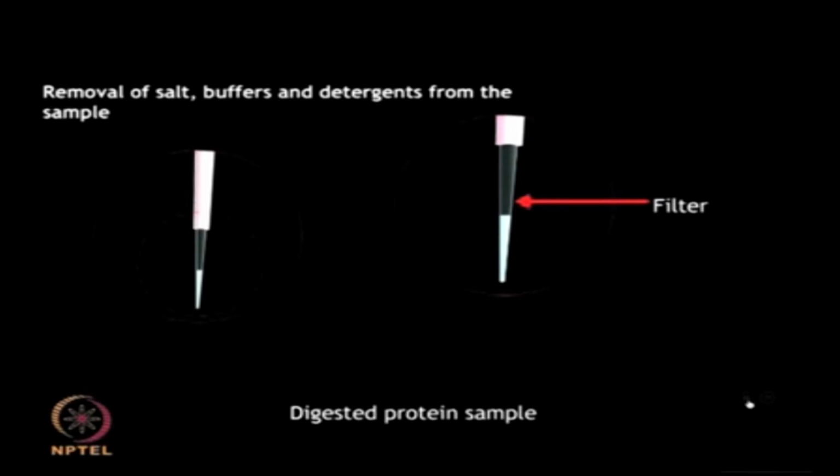It offers several advantages such as quick purification, sample enrichment, and ensures that there is no contamination. So, there are multiple advantages of using zip tips. However, it can purify only a limited volume of the sample, and also it absorbs some amount of the protein sample, thereby leading to losses.